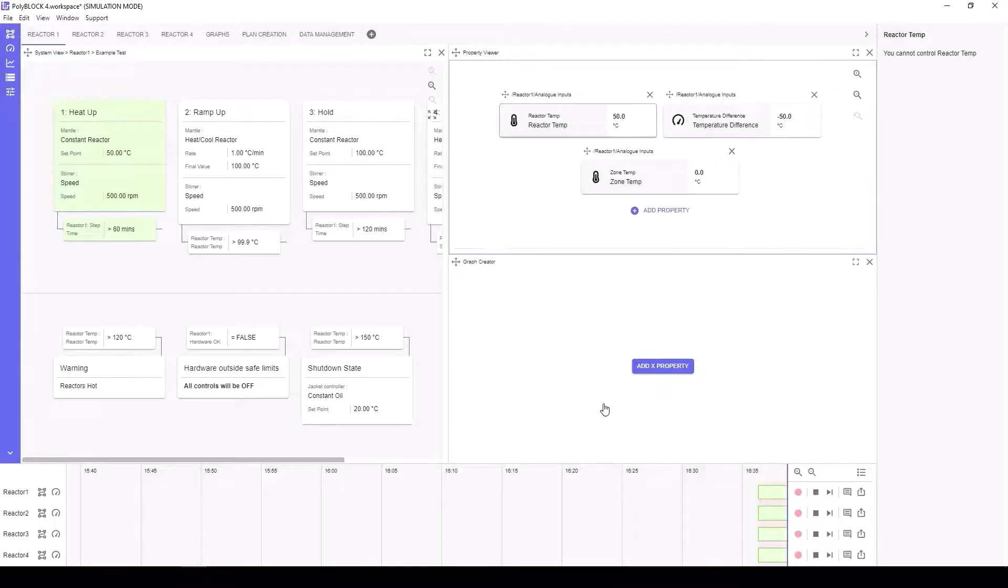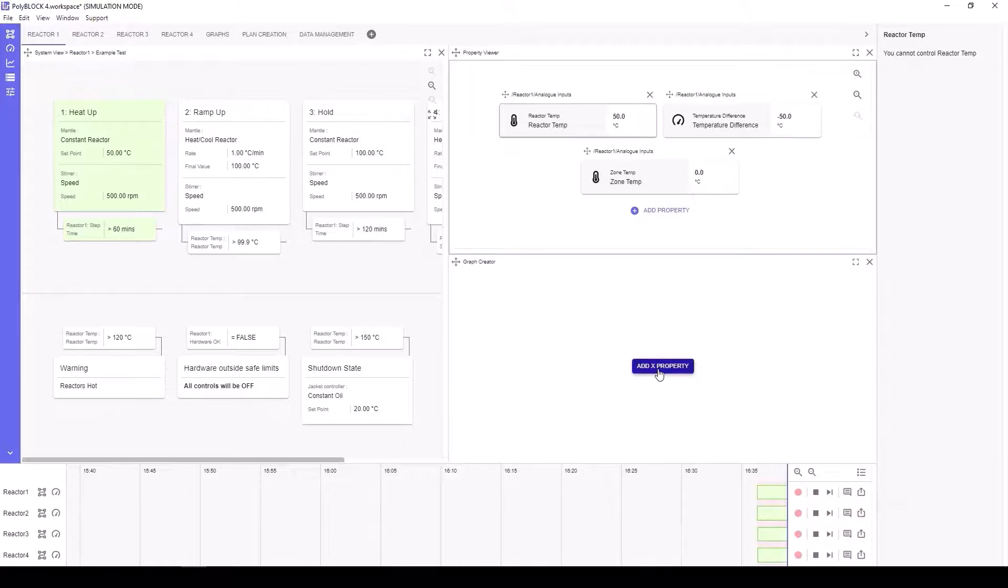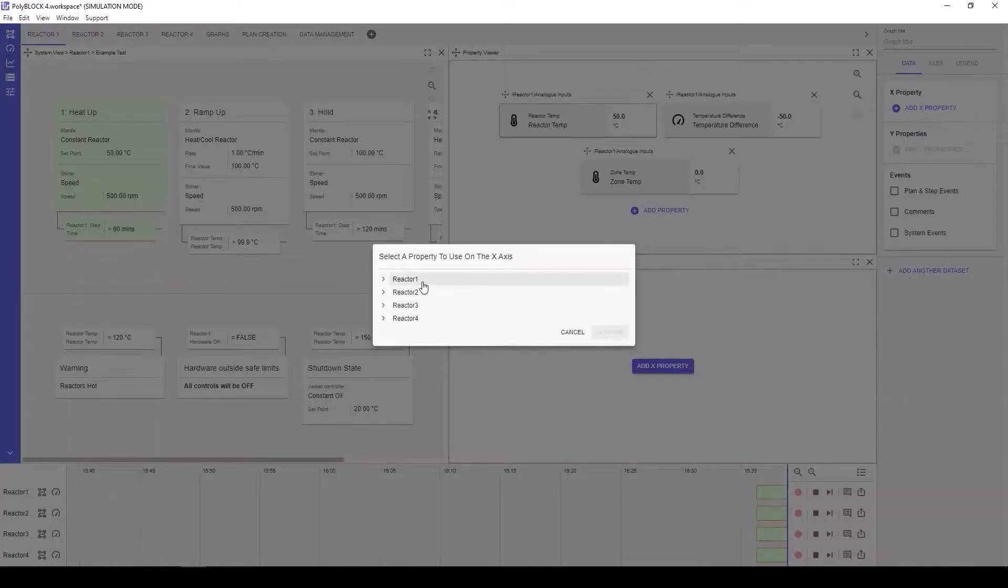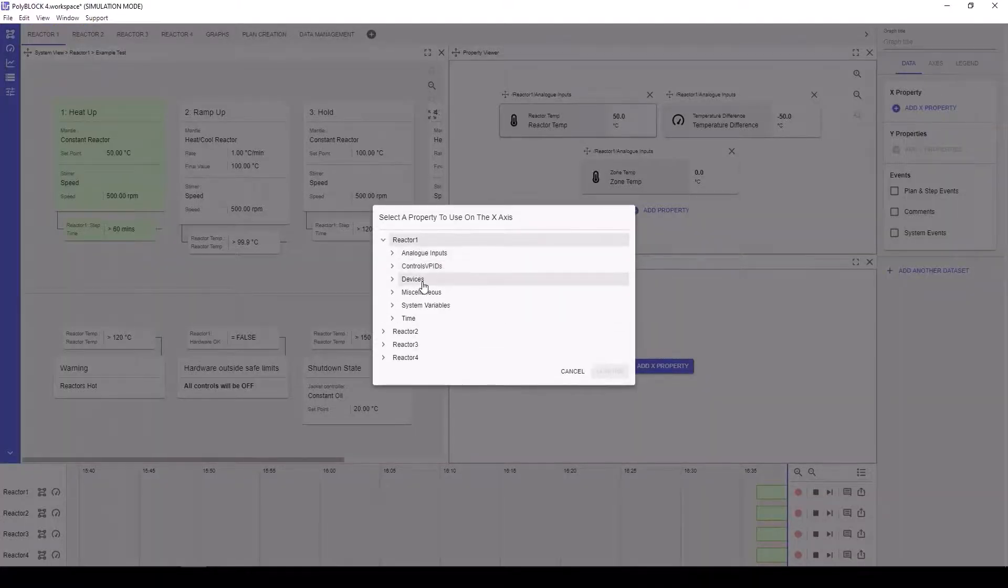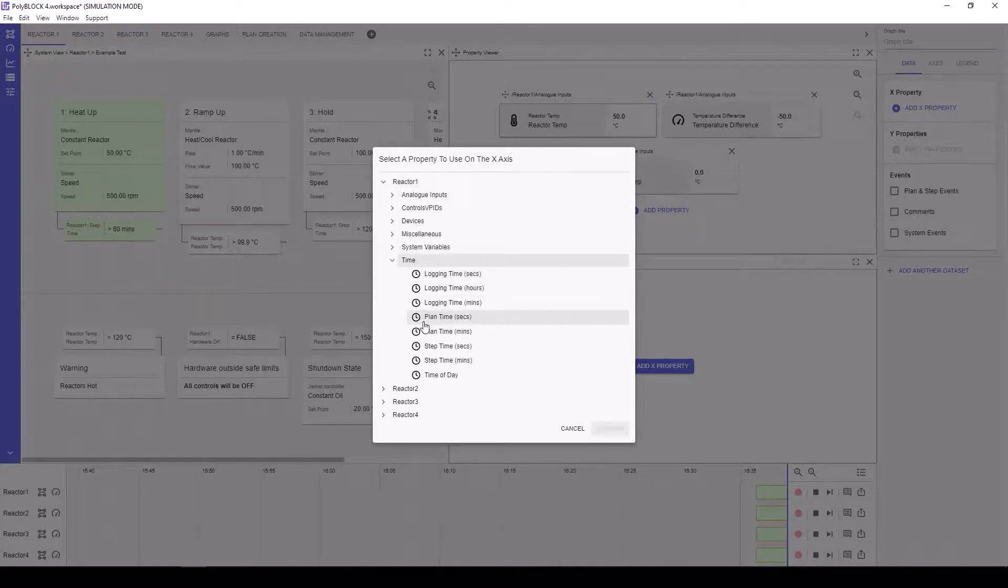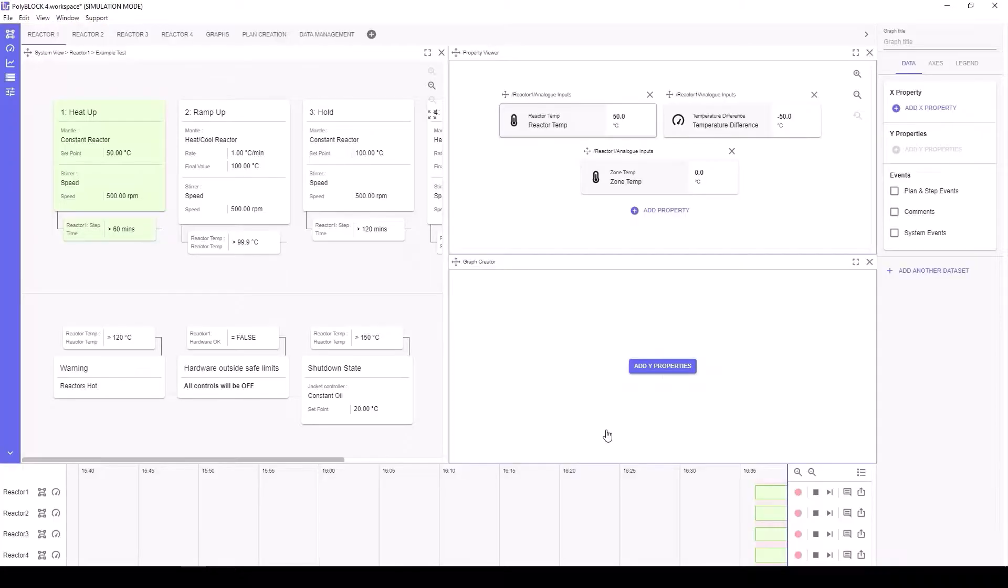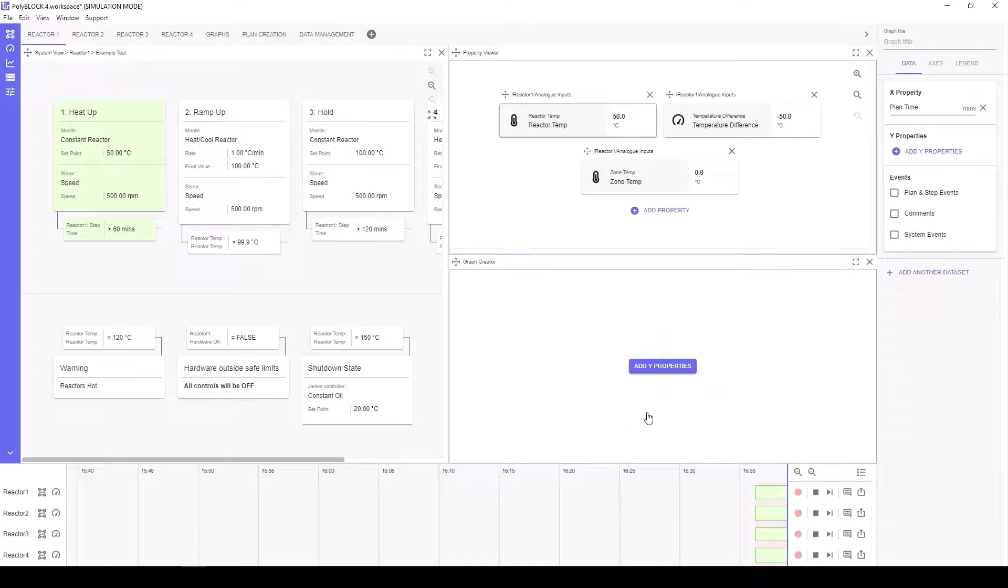If you want to plot a graph, you first need to define the x-axis. This is commonly a time variable, but isn't always. The choice is yours. Next, we add y properties, either in the app window or via the details menu.